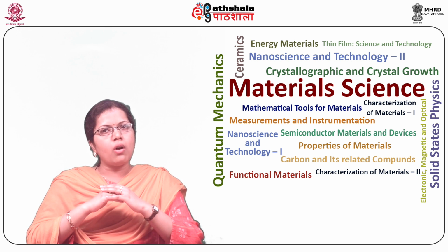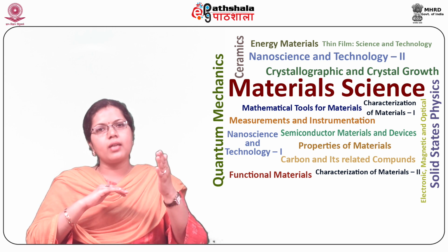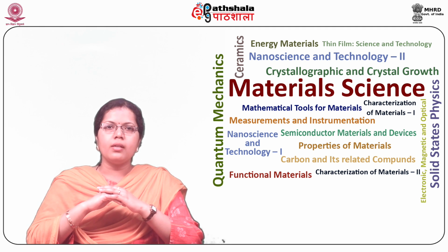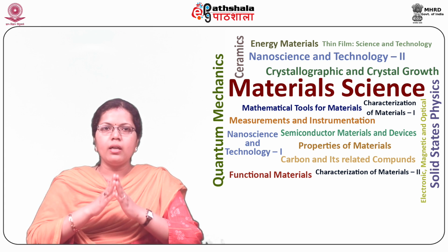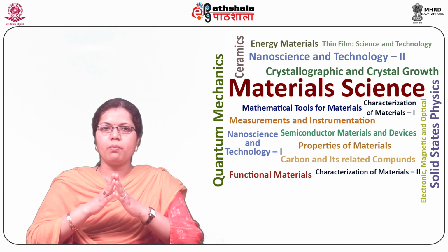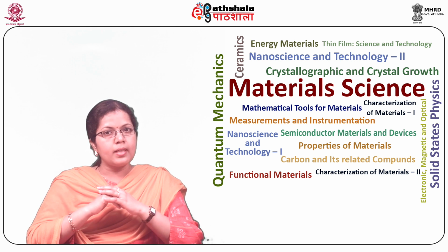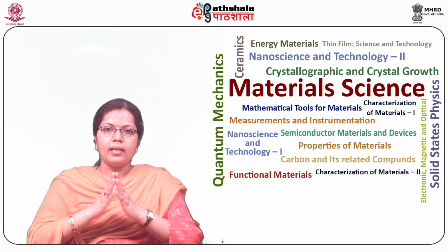However, the resolution of an optical microscope is limited by the wavelength of the light. This limitation was demonstrated by the microscopist Ernst Abbe in 1873. According to Ernst Abbe, the resolution of an optical microscope is limited to roughly half the wavelength of the light, that is about 0.2 micrometers in the case of visible light. It means that it is easy to distinguish whole cells as well as organelles.